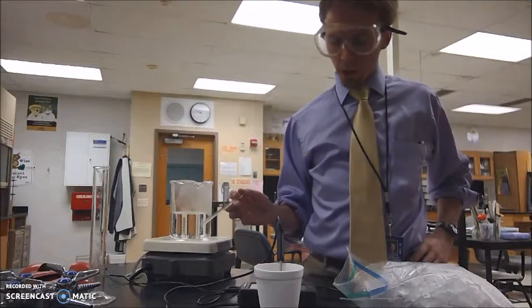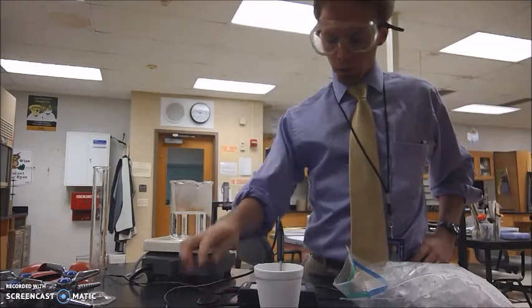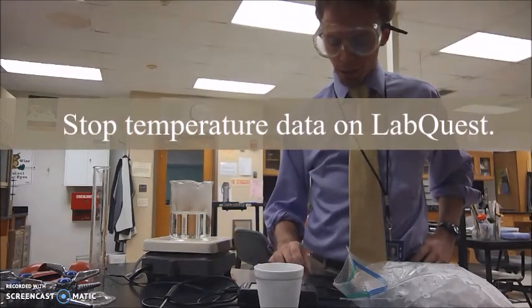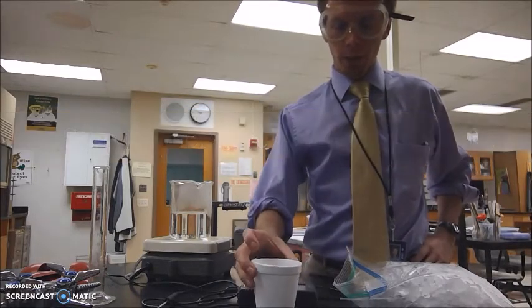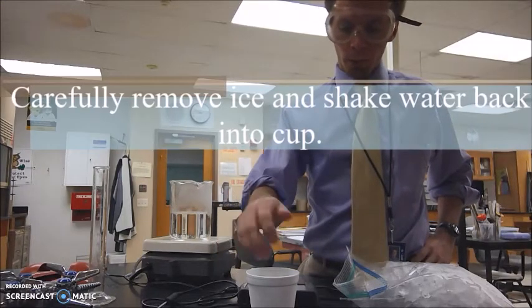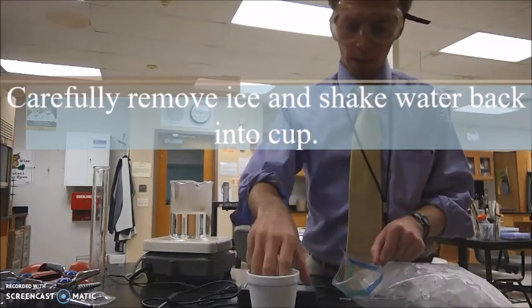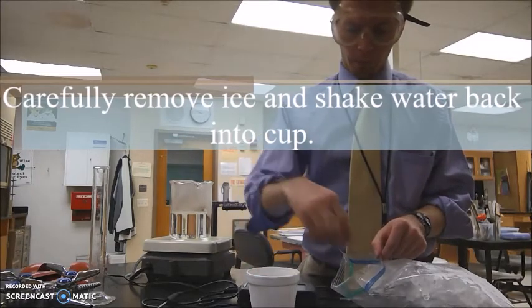Once your temperature is leveled off, mine has at about 0.9 degrees Celsius, you'll take the probe out of the water and stop the collection of data. Then you're going to take your sample of ice and water. There still should be some ice in there. You're going to remove the ice without losing much of the water. So go ahead and grab it, shake the water off, and then either return the ice or you can just throw it in the sink.